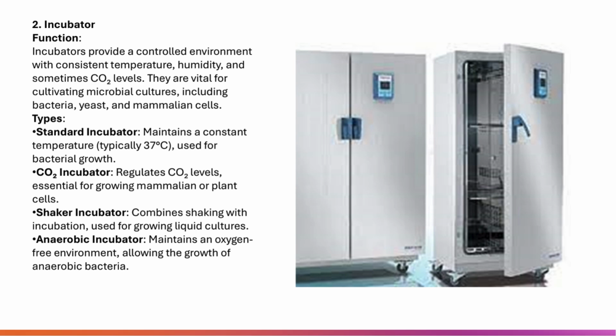Standard incubator. The standard incubator is the most widely used type, especially for growing bacteria. It maintains a constant temperature, typically around 37 degrees Celsius, which is perfect for culturing bacteria that thrive at body temperature. It creates a stable environment where microbial growth can occur at an optimal pace.